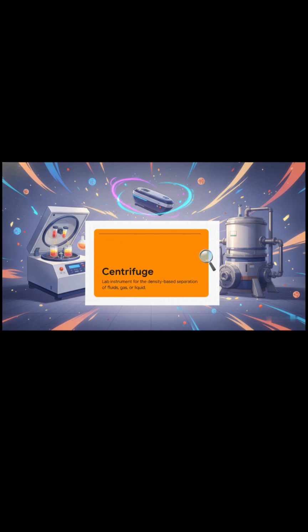You know the one. It's that lab instrument that uses centrifugal force to achieve density-based separation of fluids, gases, or liquids. Basically, by spinning a container at absolutely mind-boggling speeds, it forces heavier elements to the outside. It separates particles based on their size, shape, density, and even their viscosity.